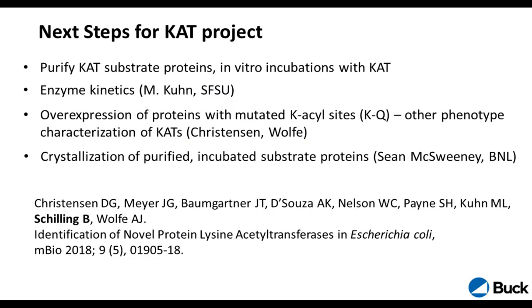And you can imagine many follow-up experiments on a project like this. You can do in vitro incubations. You can look at enzyme kinetics. We have purified these acetyltransferases now also on a preparative scale. We connected with Sean McSweeney at the Brookhaven National Lab for crystallization of some of these acetyltransferases, as well as substrate proteins that are acetylated, so crystallizing acylated proteins. But really, we needed the mass spec data to even know which ones are targets, which ones are regulated.